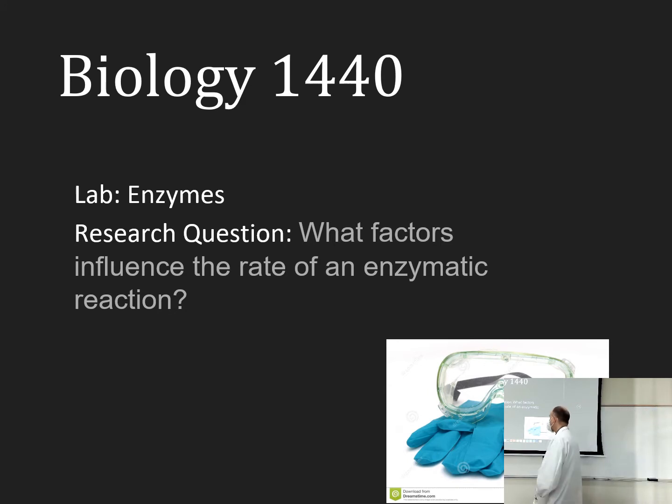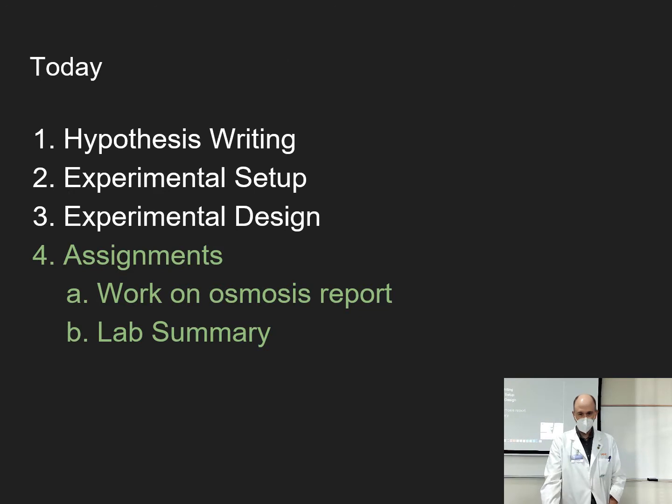Our major research question today is essentially what factors influence the rate of an enzymatic reaction. And in fact, there's a more specific research question for the day on the top of page 38 that you can look at once we get there. Does the concentration of substrate affect catalase activity is a more precise research question for today. So we'll have to define some of those things as we go.